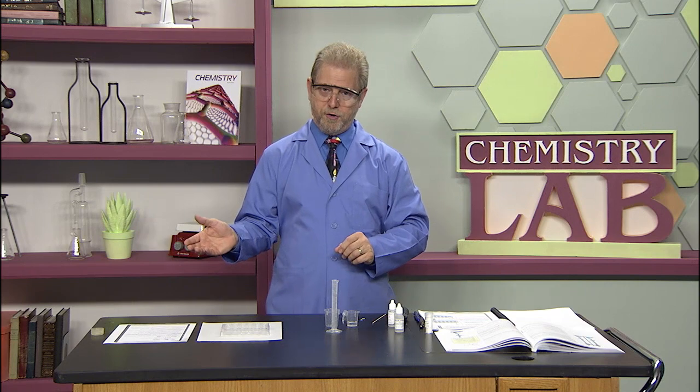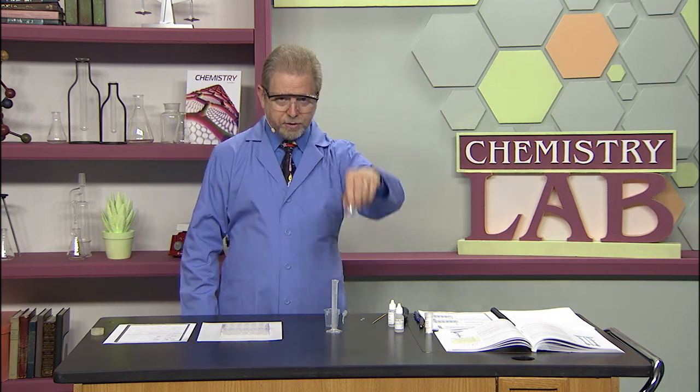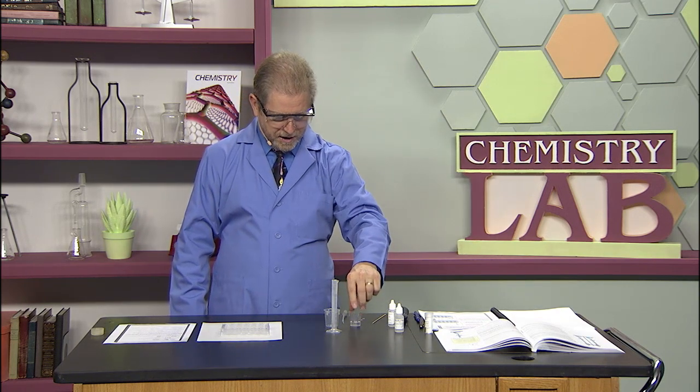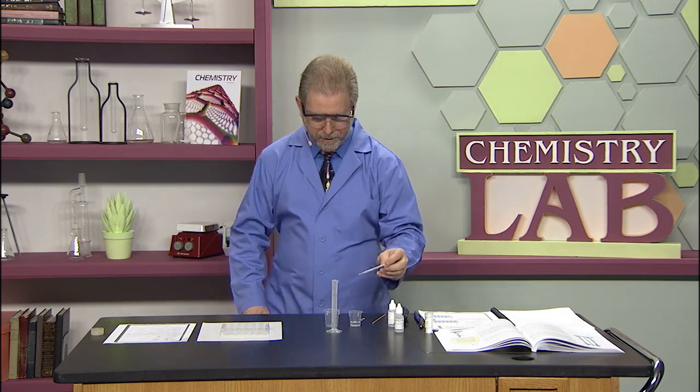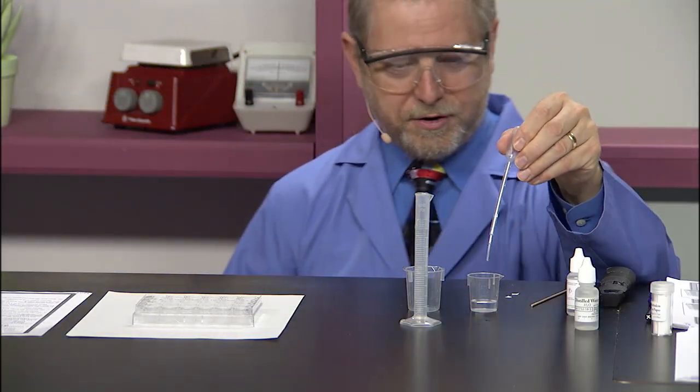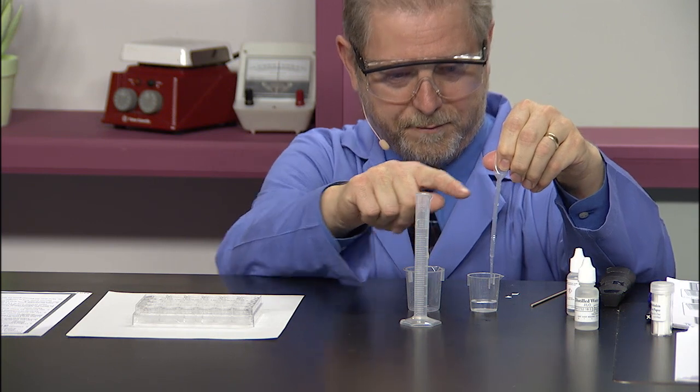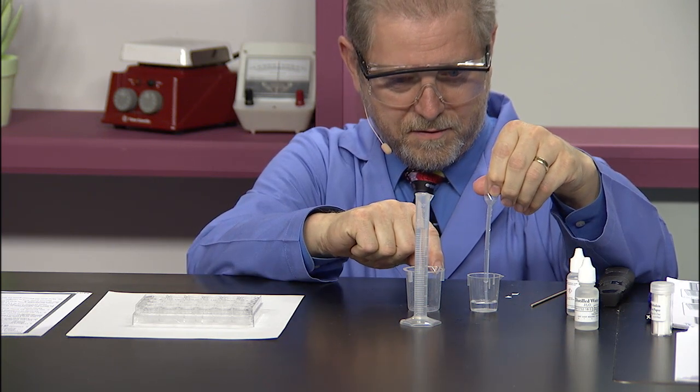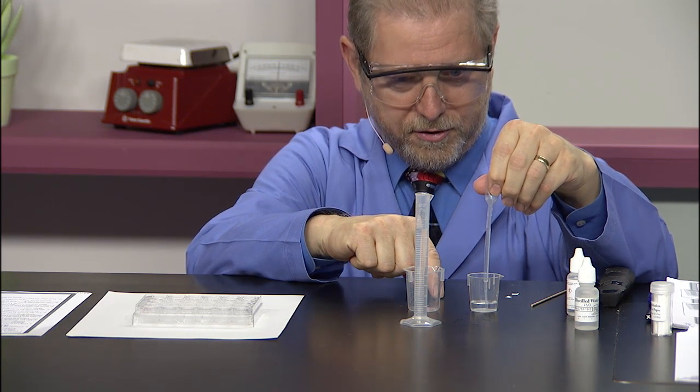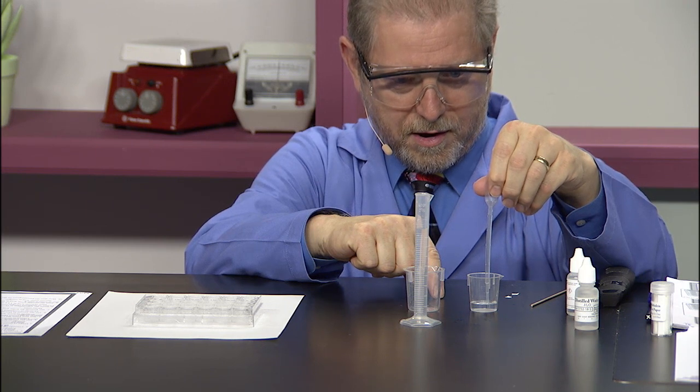The next thing is to take some vinegar, just a few milliliters into the littlest beaker. Then you want to pull up with your graduated pipette, which goes right up to this line, one milliliter of the vinegar and put that into the other beaker.